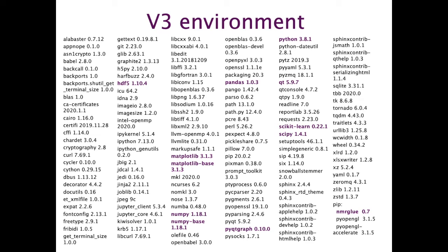Obviously, if there are packages that are not included that you would like us to include, then we can do that. We don't want to be doing this all the time because adding new packages means we have to do a new build and people have to re-download the software from the website rather than just being able to update it with the update mechanism. But it very certainly is possible to add additional packages if that's what you need for your programming.